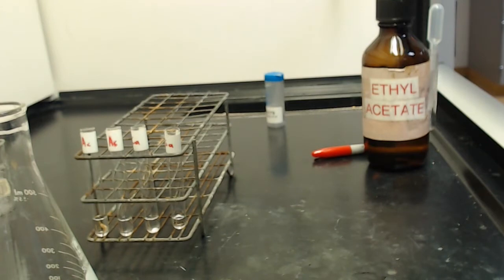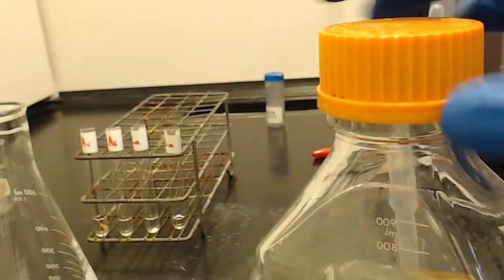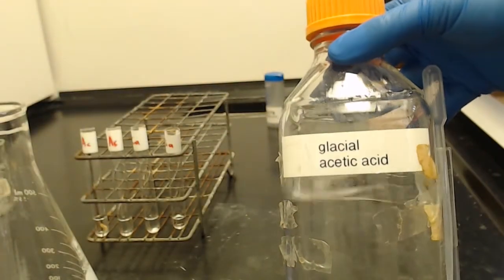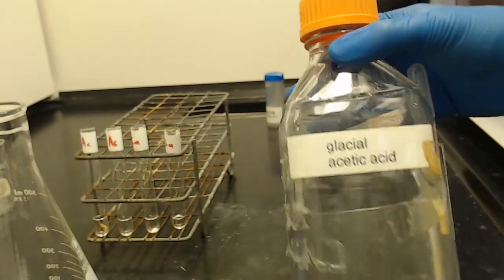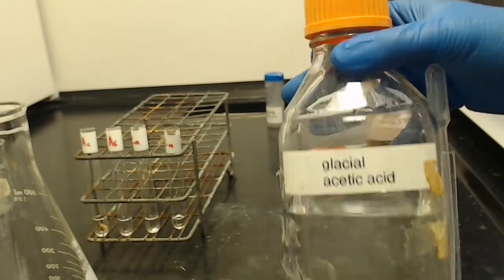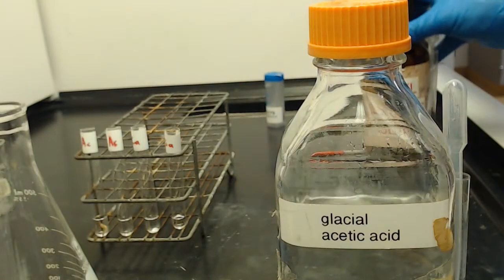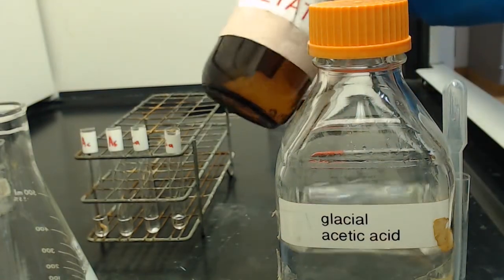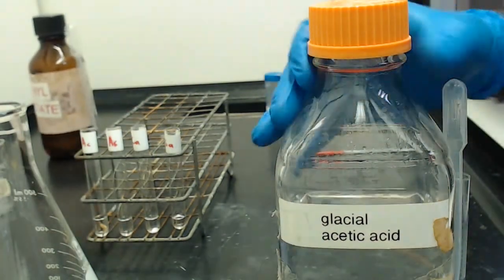Okay, for our TLC solvent, we are going to be using, I believe, 10% acetic acid in ethyl acetate. To get your 100% acetic acid, we use glacial acetic. This is concentrated acetic. It's not actually 100%, but it's concentrated acetic acid. So what I'm going to do here is take 20 mils of glacial acetic acid to 180 mils of ethyl acetate, and that should give us our 10%, roughly.